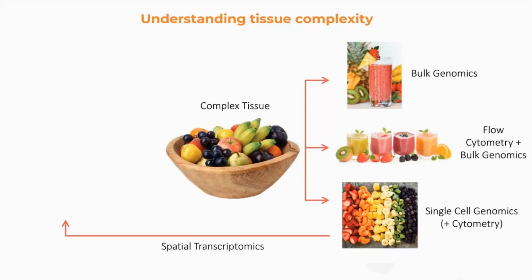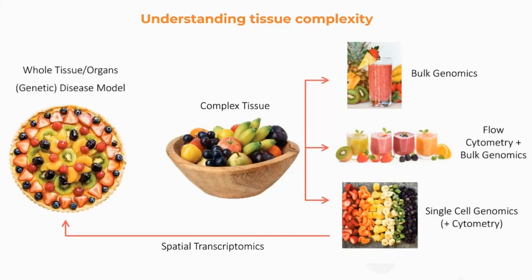What's happened over the last 4 to 5 years is that the advent of spatial transcriptomics has really enabled us to see the cells in the context in which they're found in the body, in the organ, and in the tissues. We don't need to dissociate these cells and sort them. We can look at them as they are in the tissue. That's powerful because we can start to understand the cellular content, the cellular localization, the certain neighborhoods that are found in the tissue, and so on.